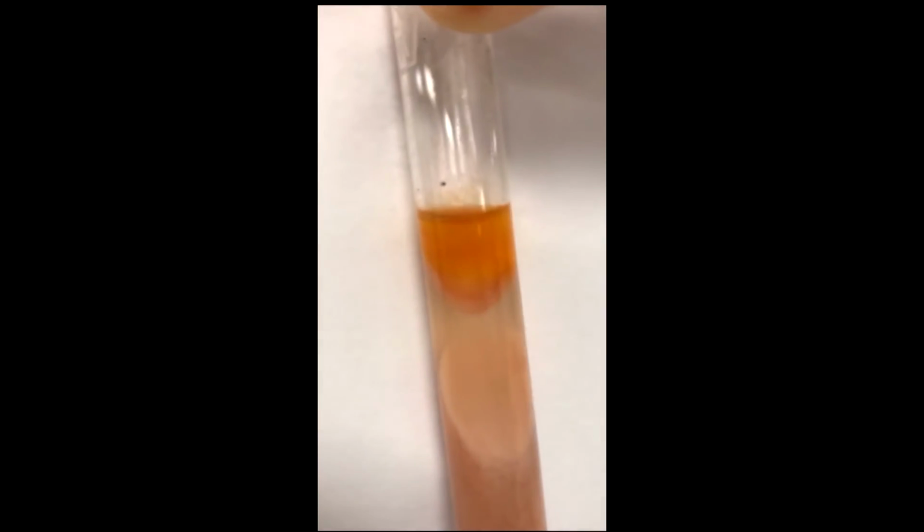and then there's a tiny, it's really hard to see, but there's a tiny pink layer toward the top that's solid, just like the pink layer at the bottom. And then there's an orange, liquidy, oily layer at the top. And so that's the results of our centrifuge.